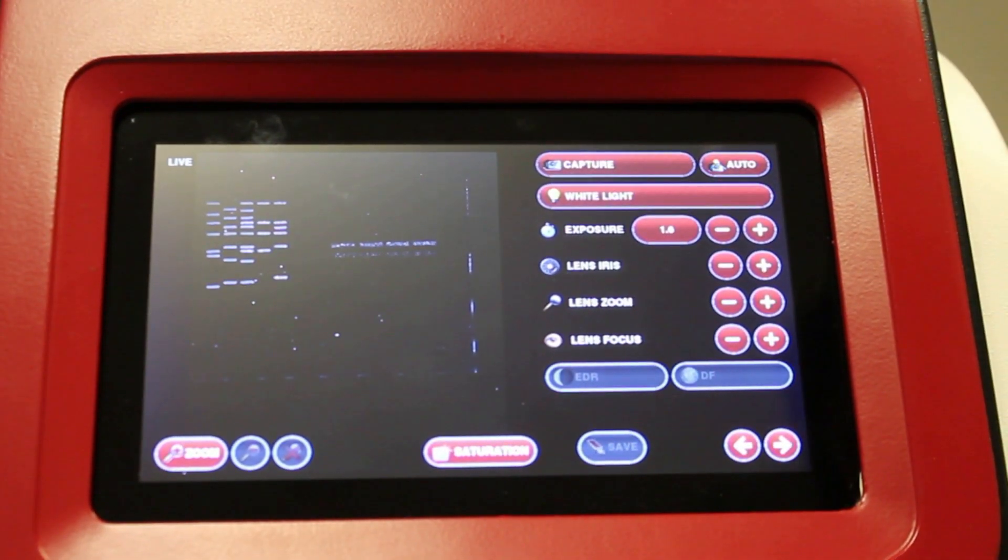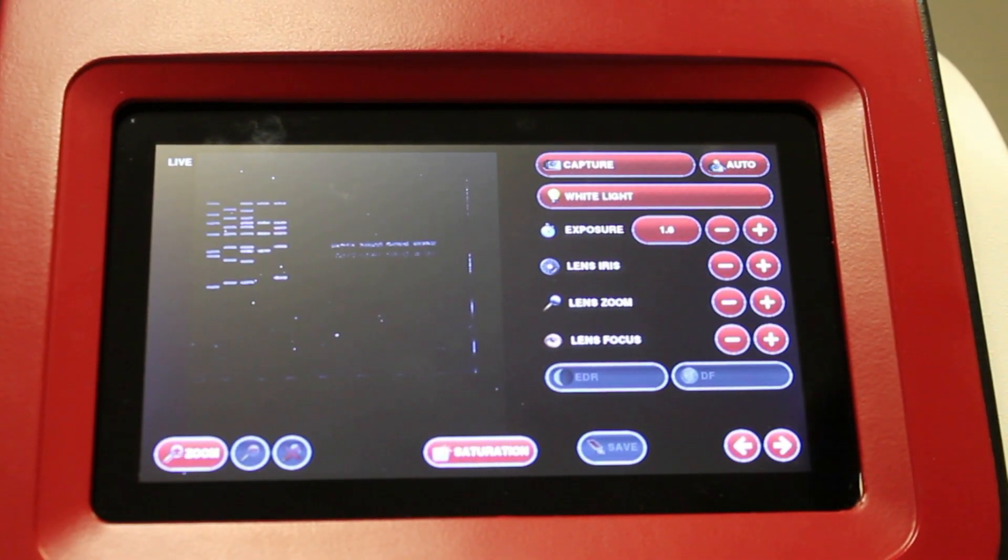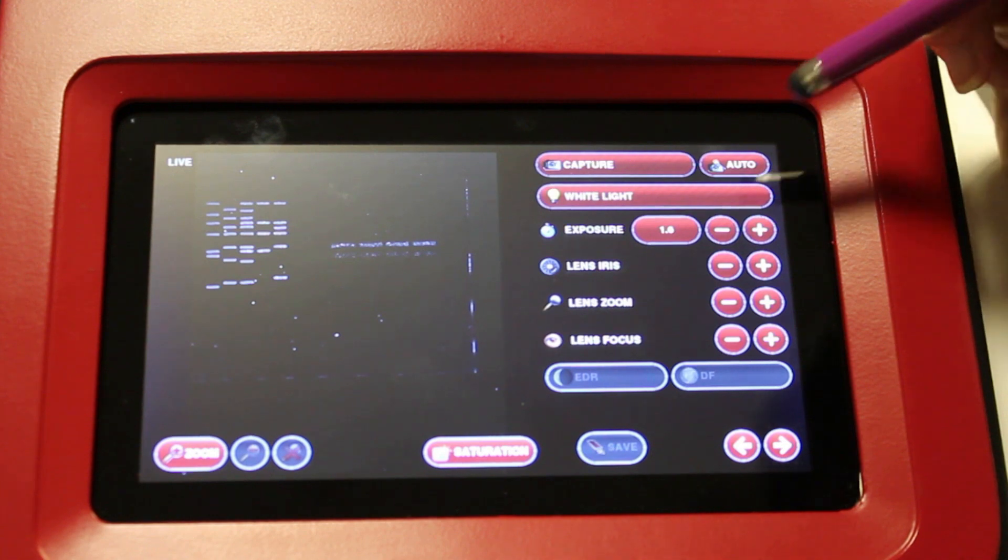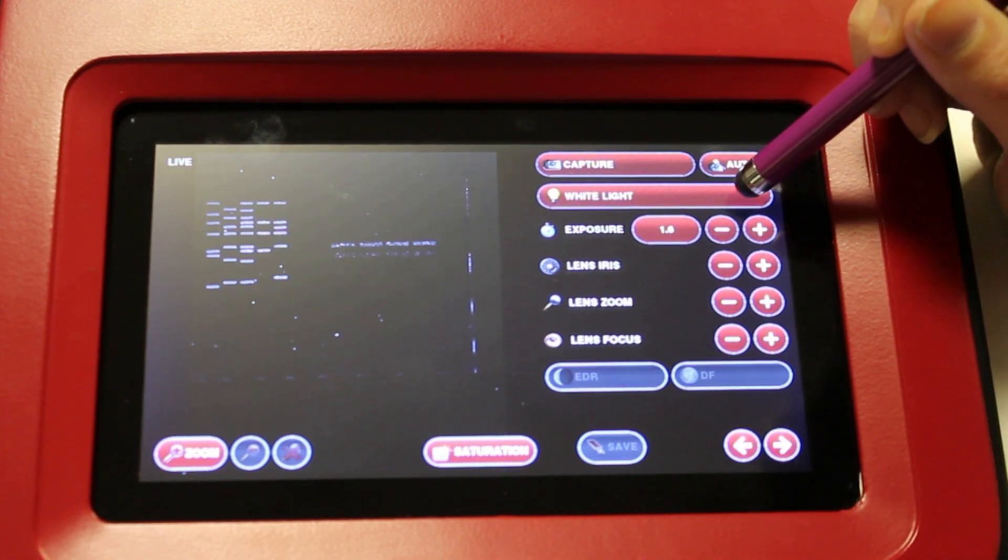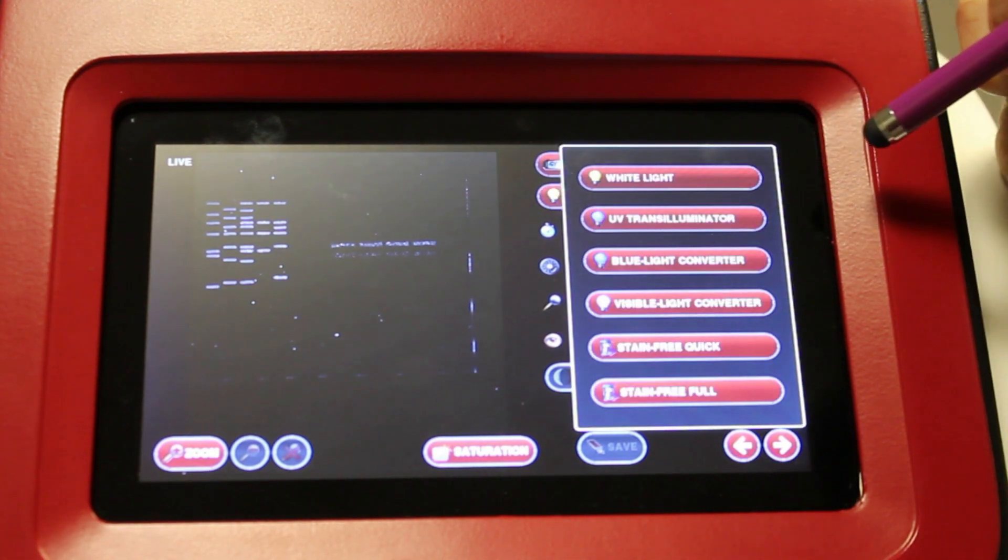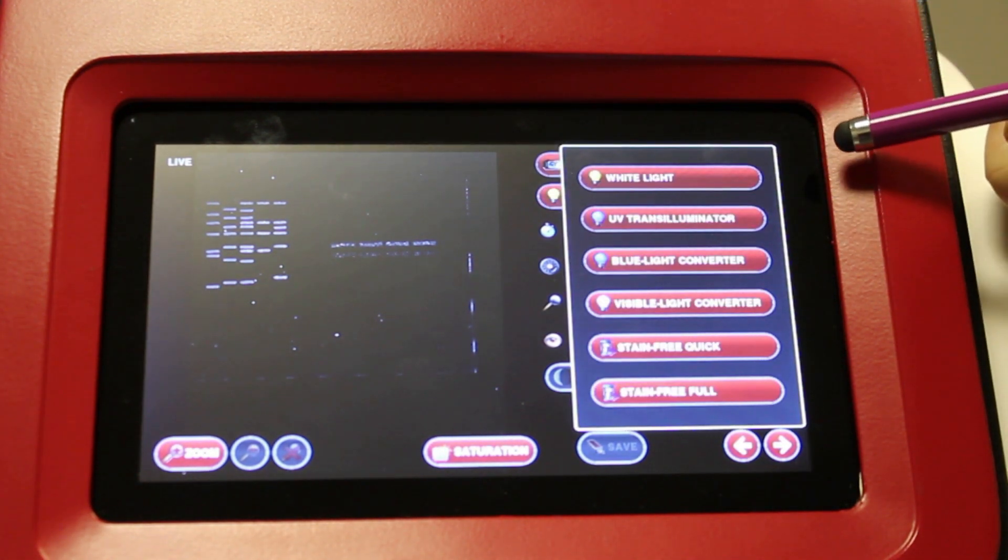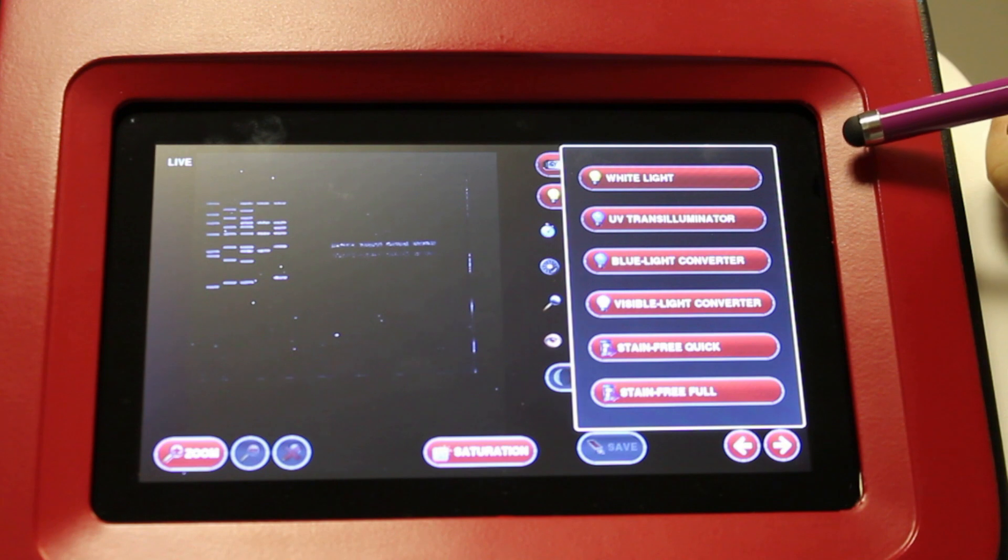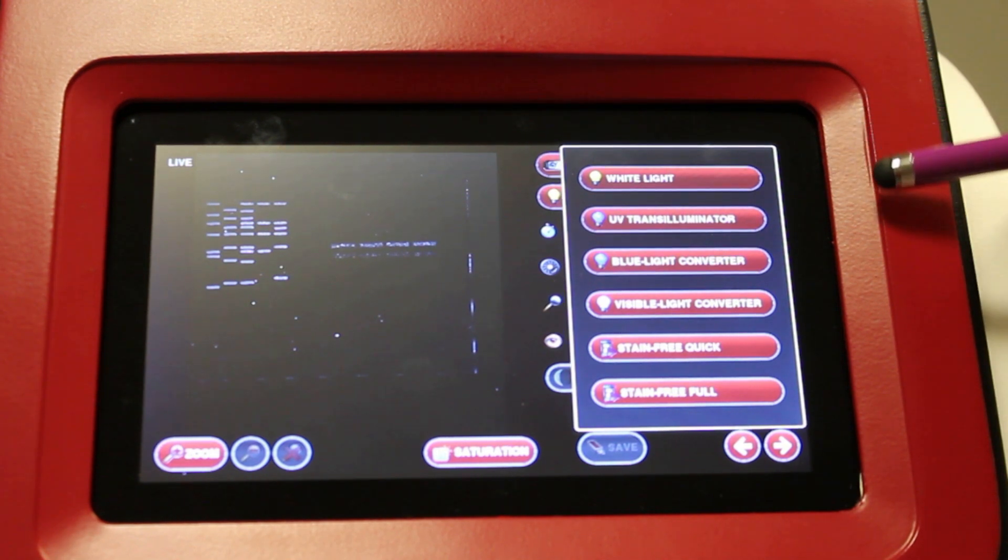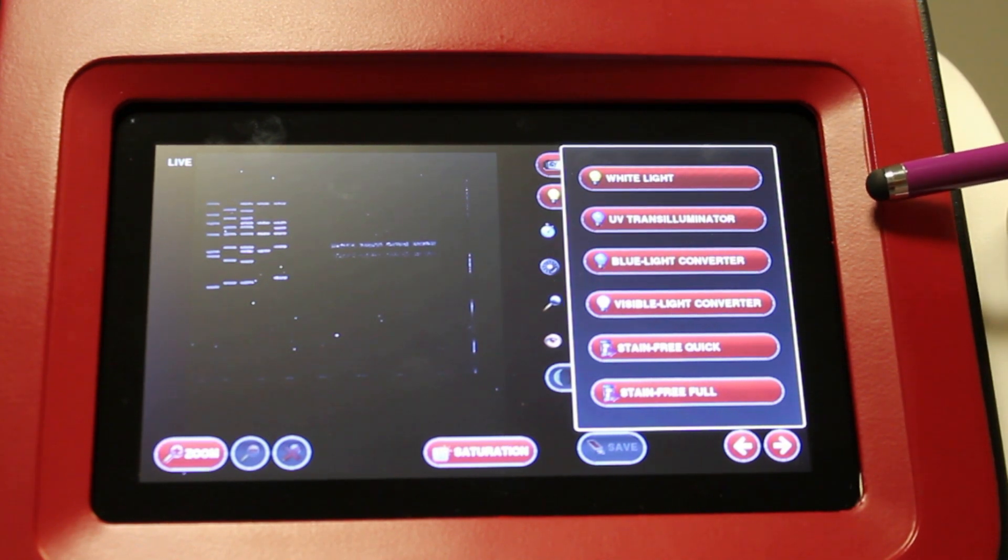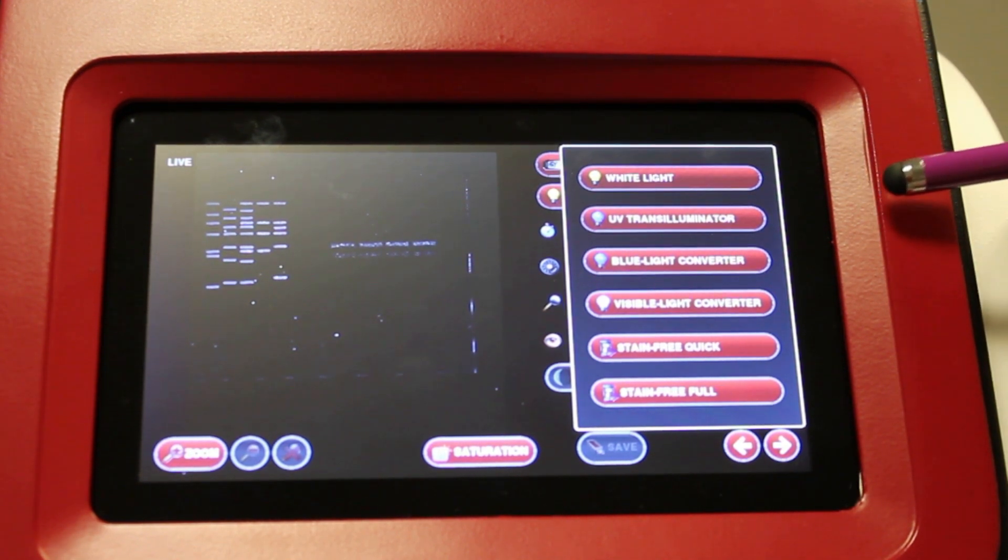Once you have your live image, you need to select your light source using the lighting menu here. You can select from white light for sample positioning, UV transilluminator for your DNA RNA gels, and blue light converter screen for imaging safe dyes.